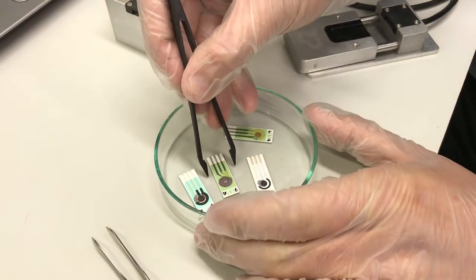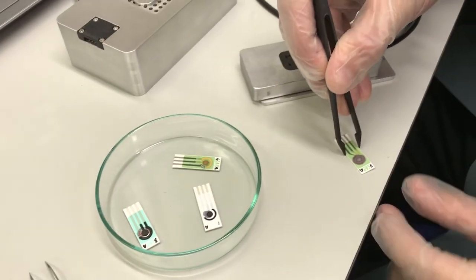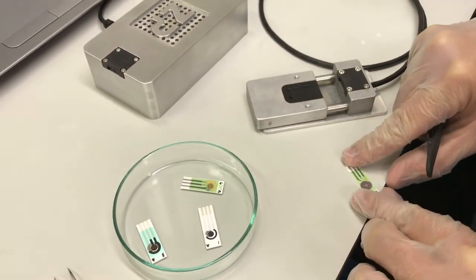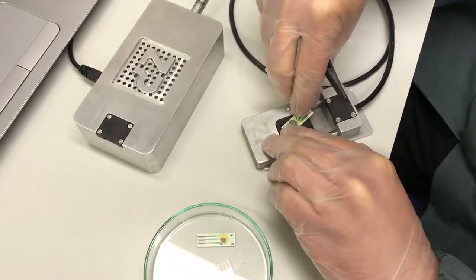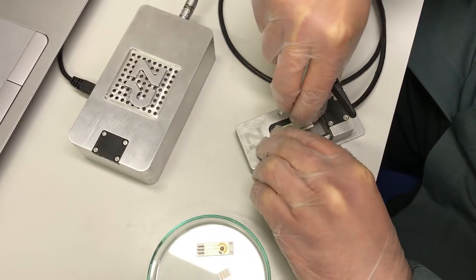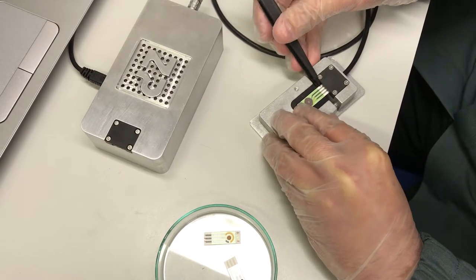So we are going to take our sensor, putting it in our detection platform, closing the connector.